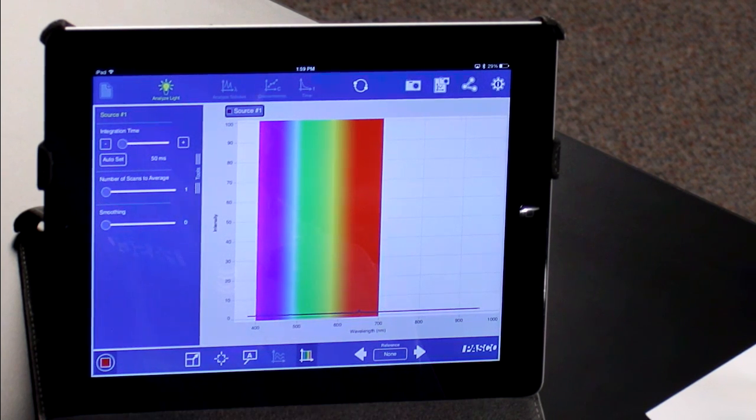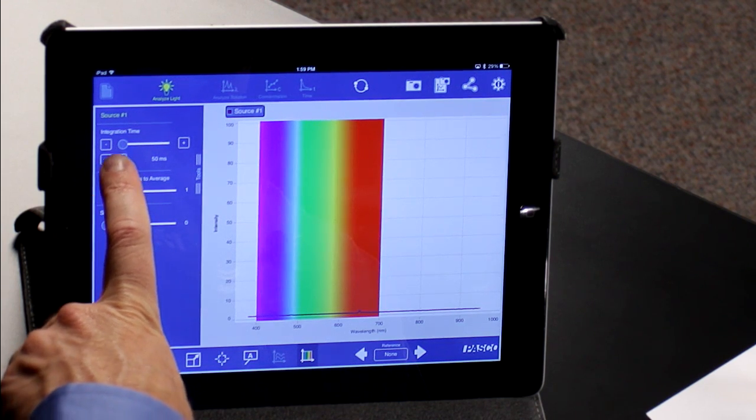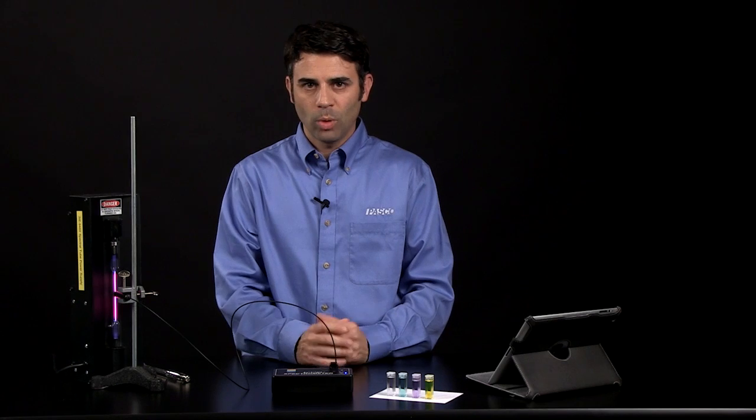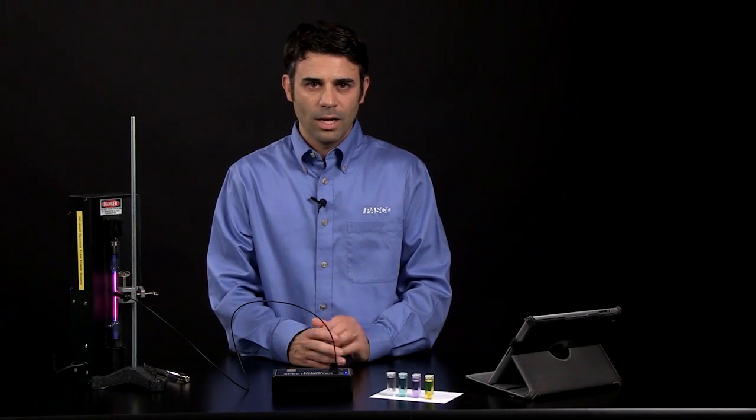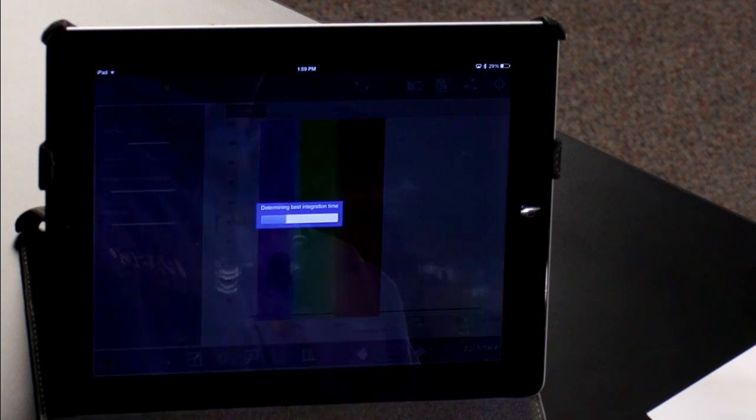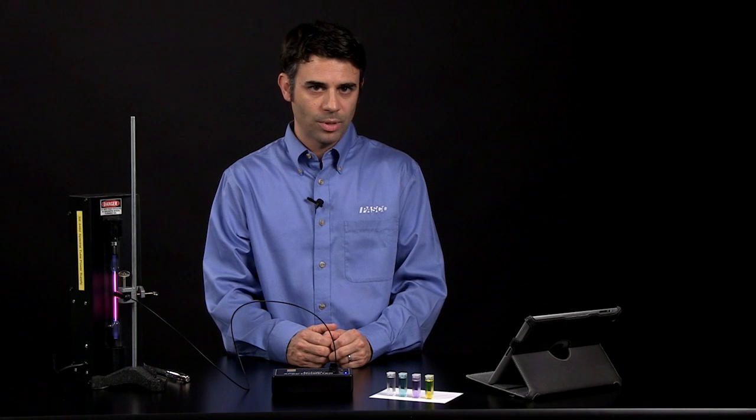You'll notice a very tiny peak on here right now. It's because not enough light is getting in. So I can auto set the integration time to allow the maximum amount of light in, while minimizing the amount of noise. The software does that for you. It will determine the best integration time and give you a progress bar to indicate how far along that process is.